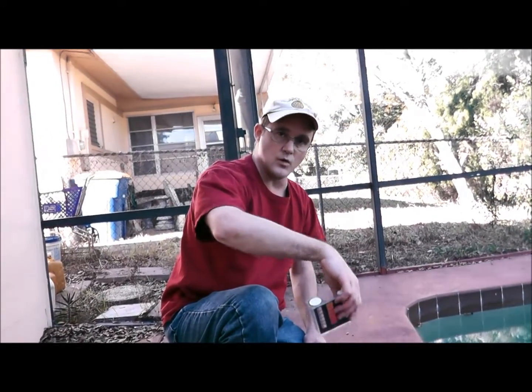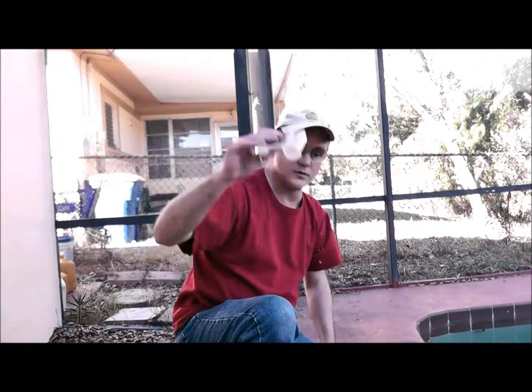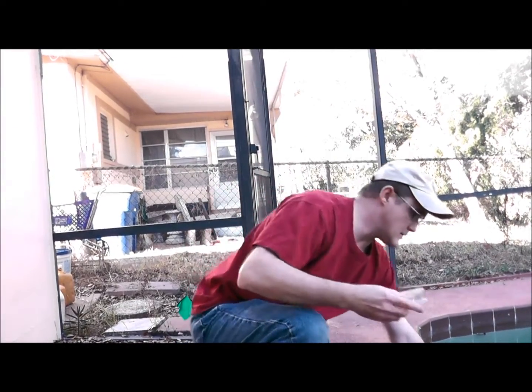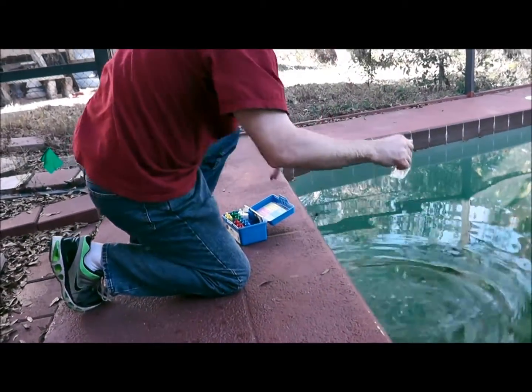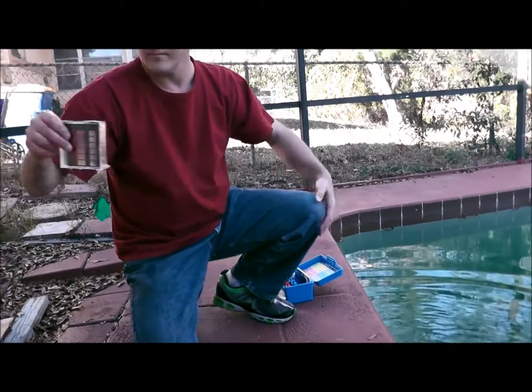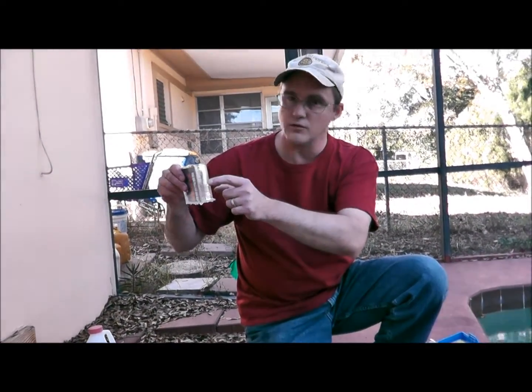Hold the vial straight up and down, go into the water up to your elbow, then flip it straight back up again — that's going to give you the most accurate reading. What you don't want to do is that big windmill thing, because it looks impressive but it's useless and does nothing. Go straight in and then come straight back up again.